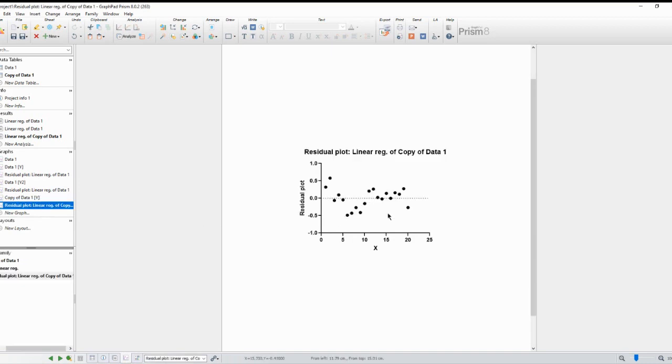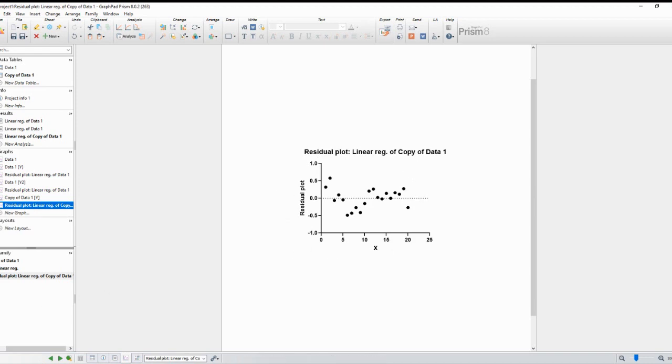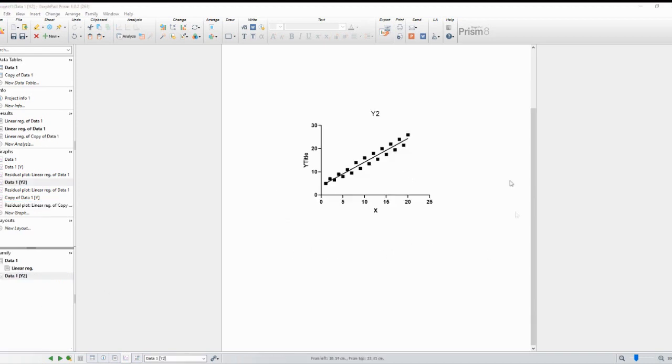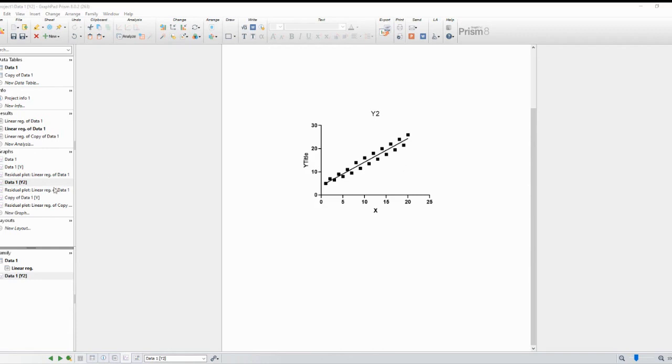If you observe a fan-like or funnel-shaped pattern in the residual plot, it suggests heteroscedasticity, which violates the assumption of homoscedasticity. This indicates that the variability of the residuals changes systematically with the predictor variable.